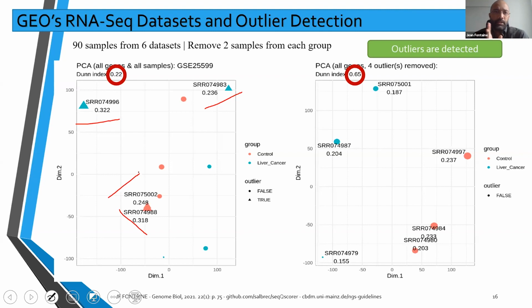Each group, what are the groups? Each data set is related to one disease and includes biological samples for the disease and a control group. Here, the 2. And so we removed these 4 samples just automatically. We had no idea if they were good or bad. And we then computed again the principal component analysis, now on the right side. So after, we see it's much easier to cluster, to differentiate the data using the gene expression. So it was a very good idea to remove these samples.